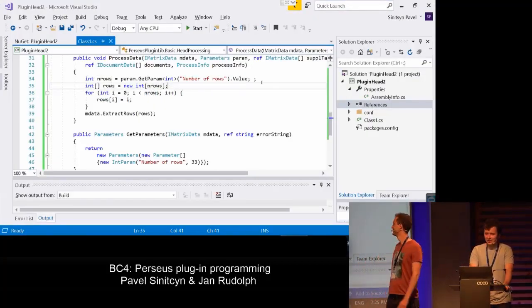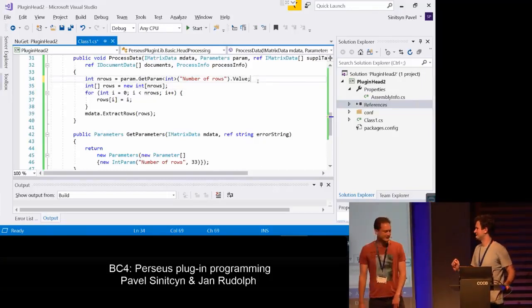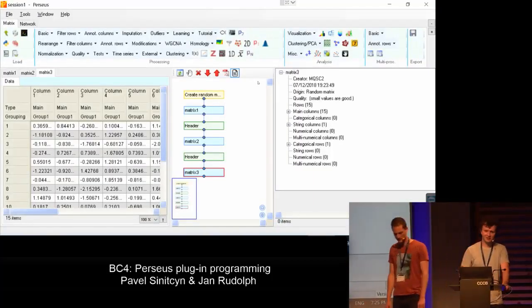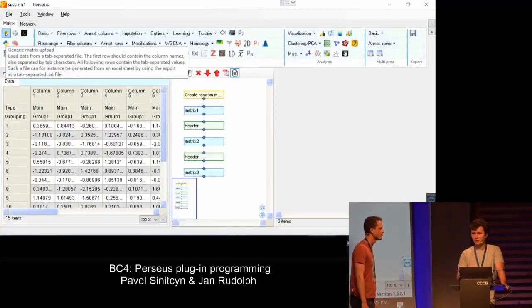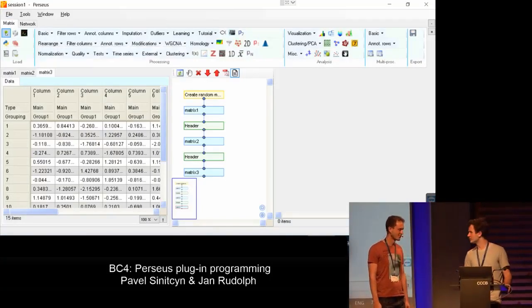So, but how can we deal with this? And let's say, how can we deal with this nicely? I will show you what it means nicely. What was before was not nice. Before, we basically just wrote some message, which I think every normal user will be angry to see.